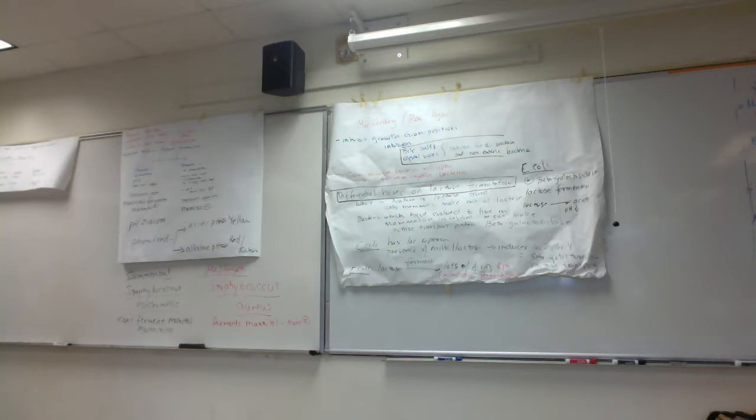So if we had an outbreak of Staph aureus in your hospital, could you do nasal swabs and inoculate your MSA plates for a quick screen of folks? If somebody has a lot of yellow colonies growing right from their nasal swab on MSA, you'd want to follow up to see if there are colonies with Staph aureus. And again, this would be just like if you're having a problem with Staph aureus outbreaks amongst your patients, hospital-acquired Staph aureus infections, right? Okay, does that make sense, folks?